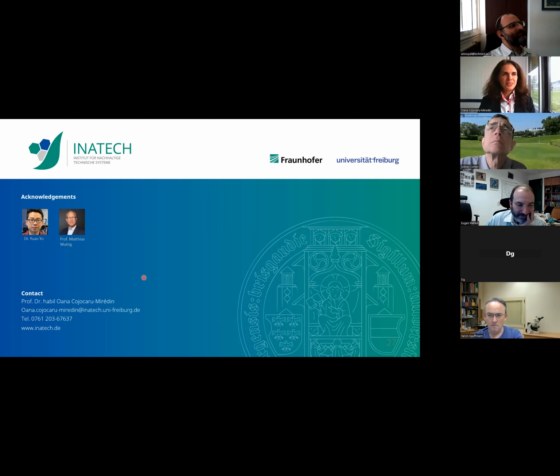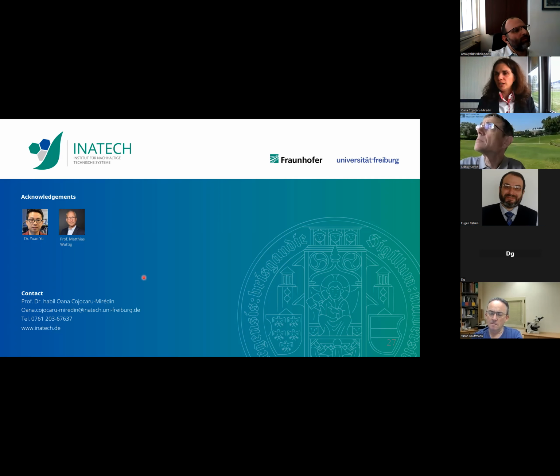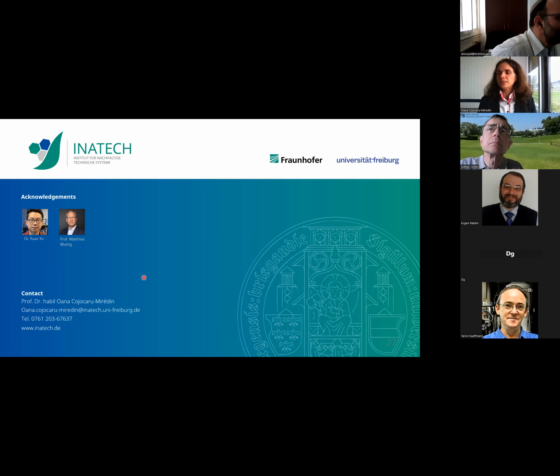Yeah, right. So this is a very key question, and the atom probe has been strongly developed to tackle these questions. If you are interested in that, it is the group of Baptiste Gault in Düsseldorf, at the Max Planck Institute. The problem with the atom probe is that we have some impurities, very often hydrogen, which are still in the chamber, and hydrogen or water molecules can easily get inside the tip. Of course, not in a very high proportion, but it makes quantitative analysis very difficult to realize.